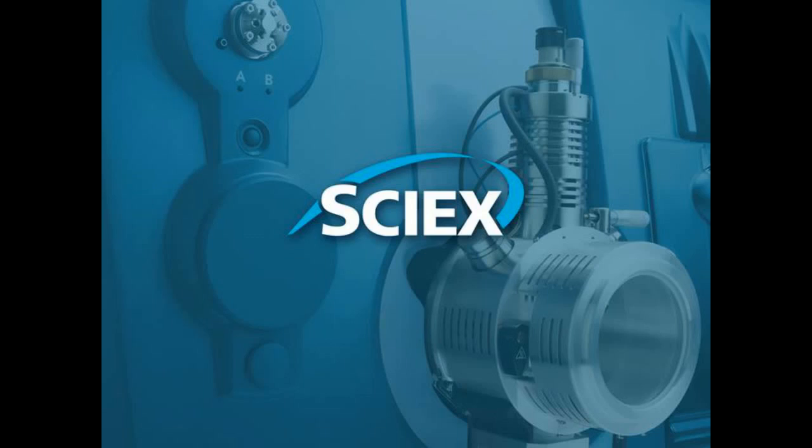I think we haven't tried it yet. For loading larger volumes of extracts, what we would do is we'd try to use a process called isotachophoresis, in which case what you do is you actually dilute your sample into a salty solution which allows stacking. That allows you to inject more and fill more of your capillary with sample to increase the sensitivity.